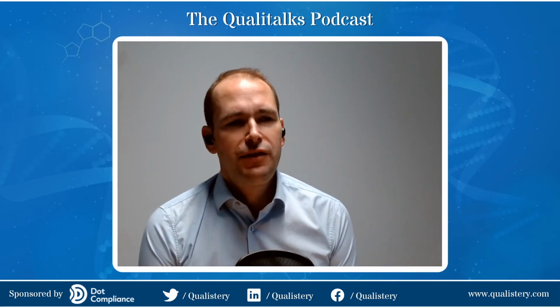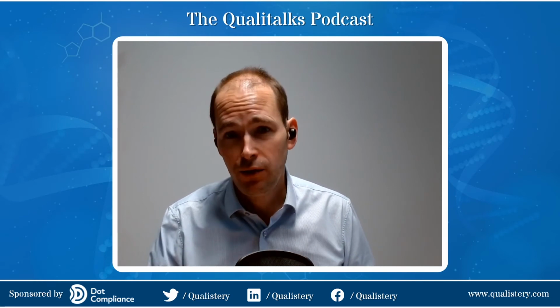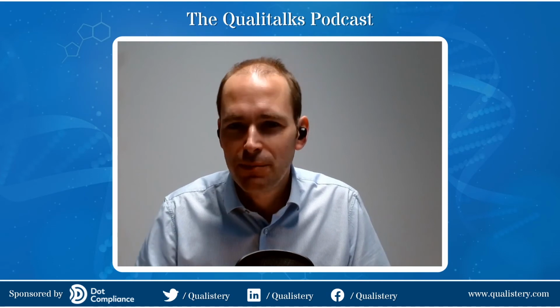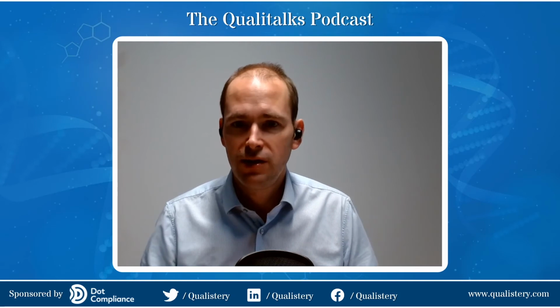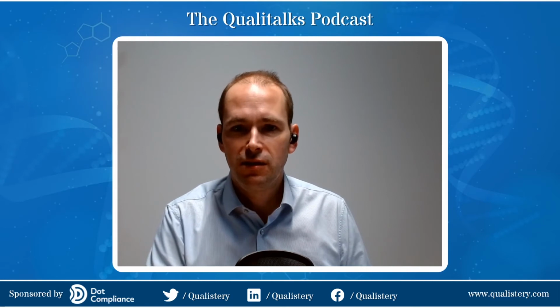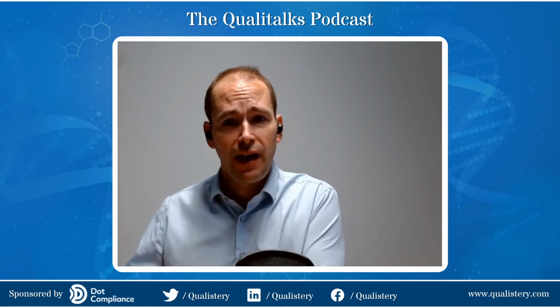There are a few regular pitfalls that people fall into. One would be wet loads. They're easily overlooked. There used to be a phrase, "sensibly dry," for an autoclave load, which is kind of subjective because people would say, well, it's only a little bit of water, that's relatively sensible. I think the meaning from the original standard was that it's detectable by the senses. So if you can see it, touch it, or feel it, then the load is wet. With wet loads, what we're concerned about is that they can easily get recontaminated with microorganisms. So that is an issue to be aware of. And it could also be an issue with the quality of the steam that we're using in the autoclave, which could affect that wet load.